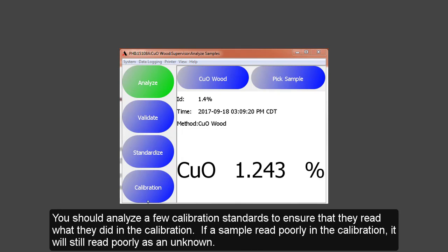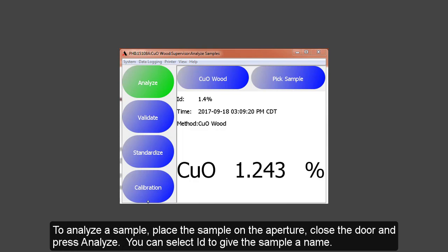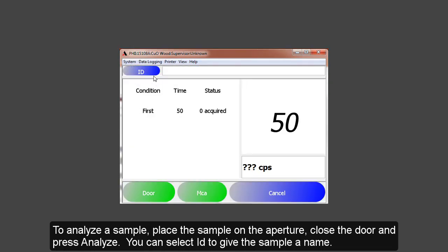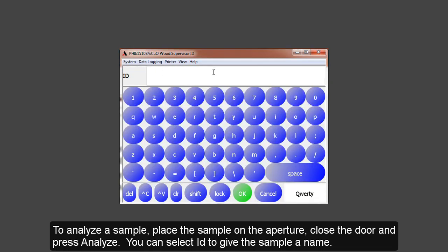After the calibration, you should analyze a few of the assayed standards to ensure that they read what they did in the calibration. If a sample reads poorly in the calibration, it will still read poorly as an unknown sample. To analyze the sample, just place the sample on the aperture and press Analyze. You can select ID to give the sample a name.